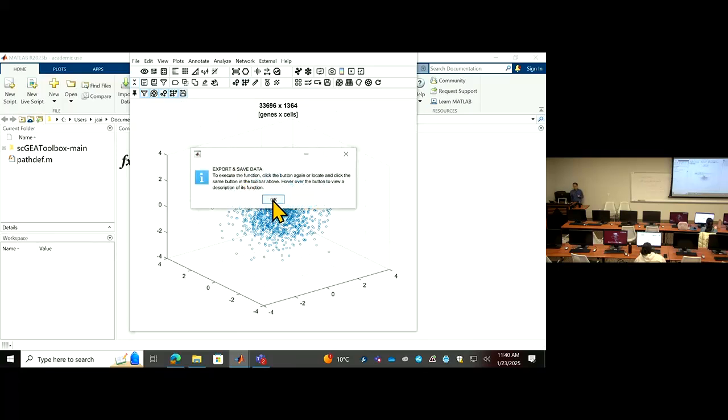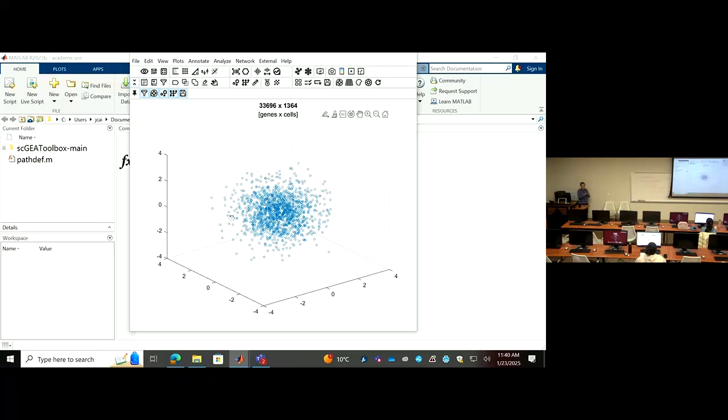And number 5, after you finish annotation of this individual sample, remember there's only one sample, later we will add more, and use 3, 4 or 5 to compare them to each other. But right now, we just learn how to deal with this single sample data.